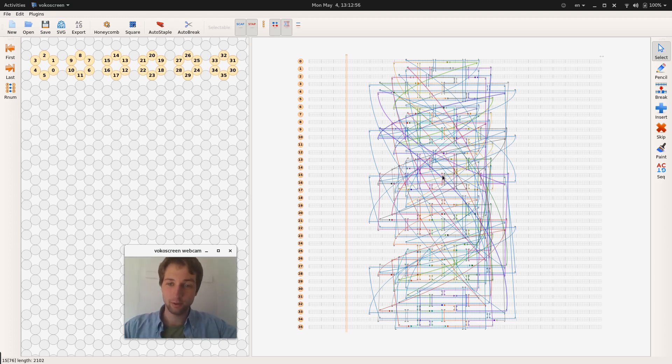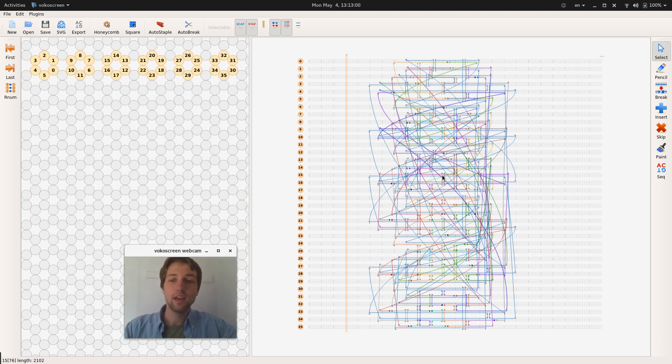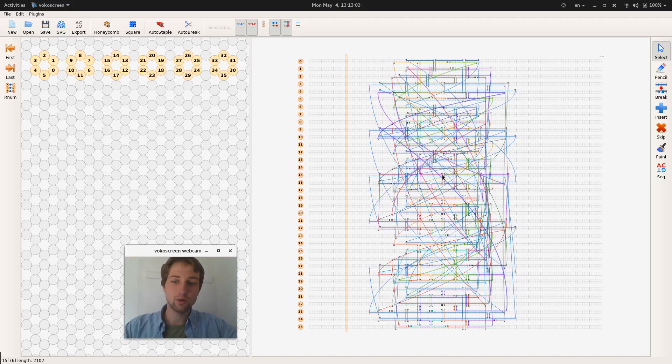So you can also use this workflow to just inspect your structure in 3D and make sure that everything is connected as it should be.